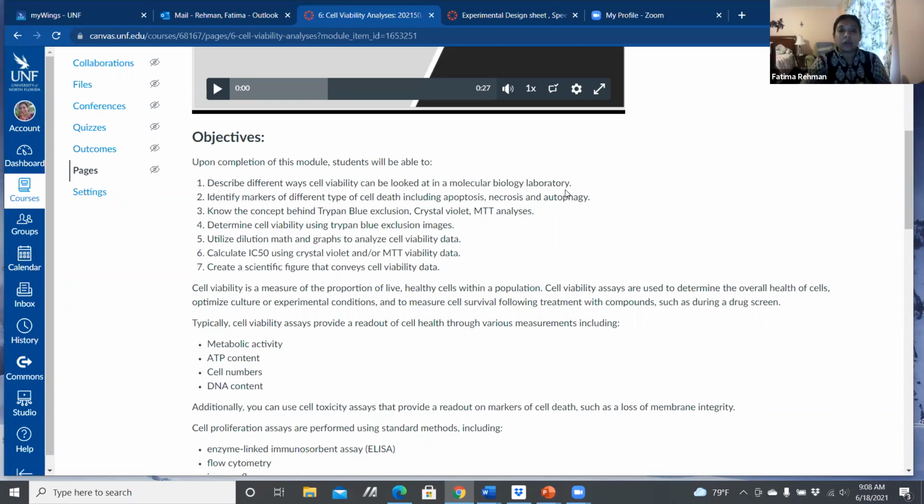So today, as one of our observations, you can try to observe the cells and see how the cells are dying. The ones that are dying, how are they dying? Are they dying through programmed cell death? Are they dying through this explosive necrosis? Or are they dying because of a starvation response, whether it is a perceived or a real starvation response of the cell?